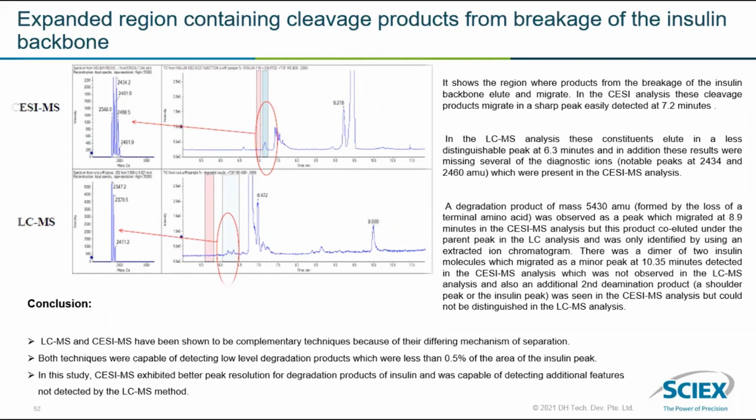The degradation molecule is separated around 7.2 minutes. We can also see the small impurities present in the sample by using both methods. In the LCMS profile, you can see small peaks which are coming from the gradient or the buffer.